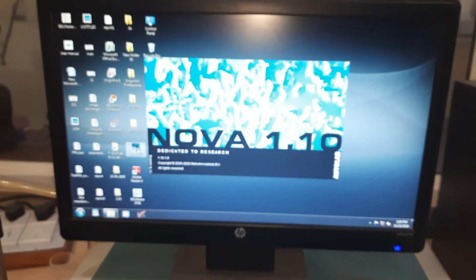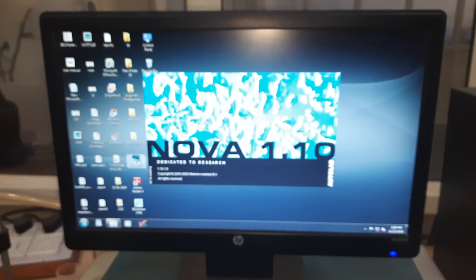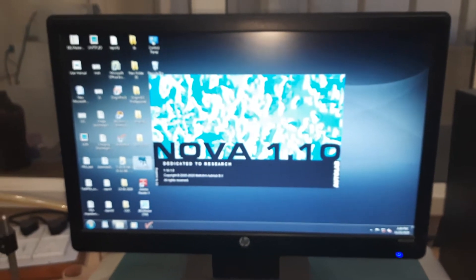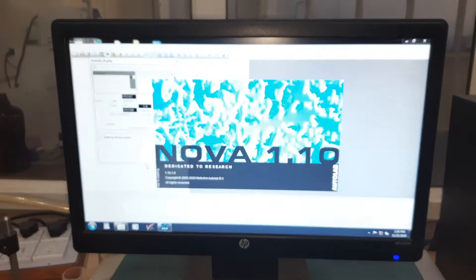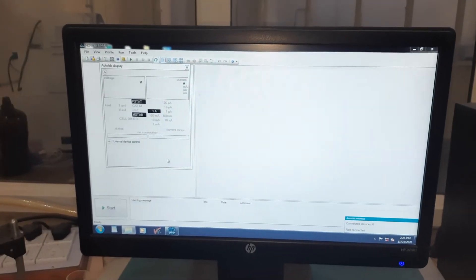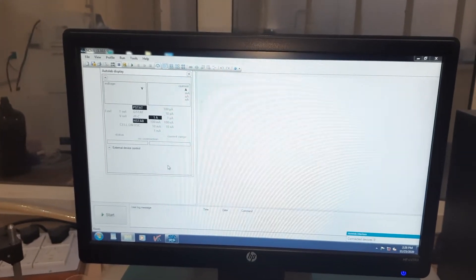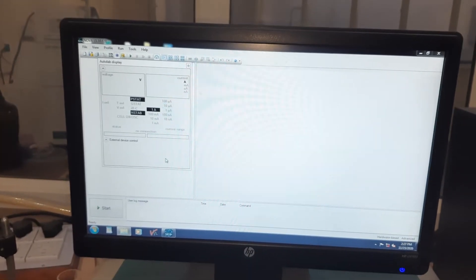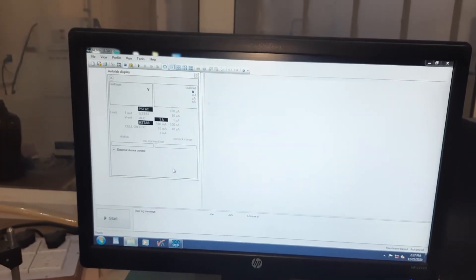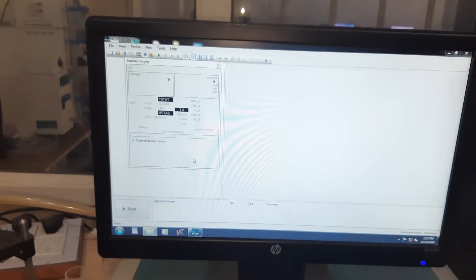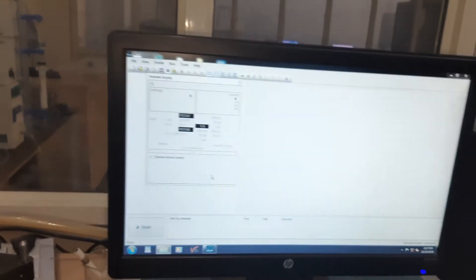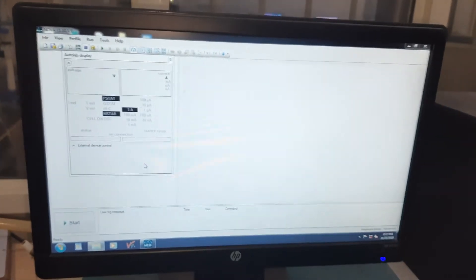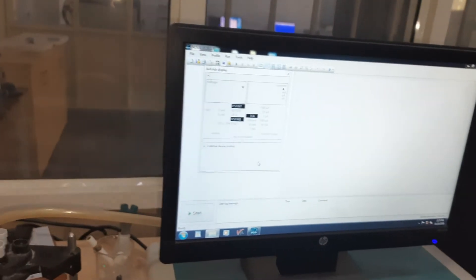Before we can carry out an experiment in the software, I think what is important is that you see how the experimental setup looks like.